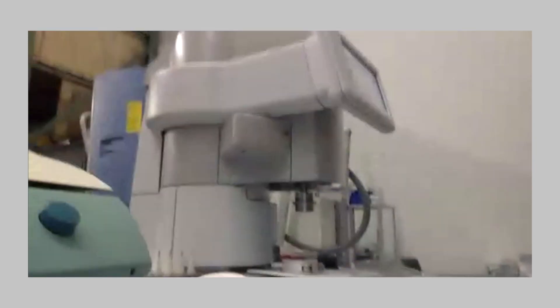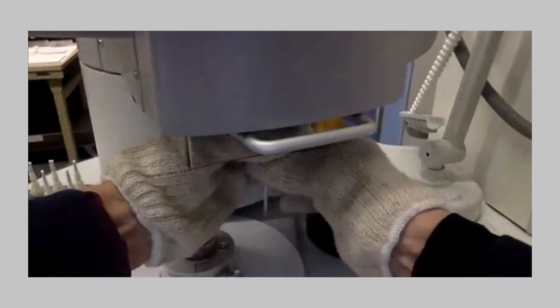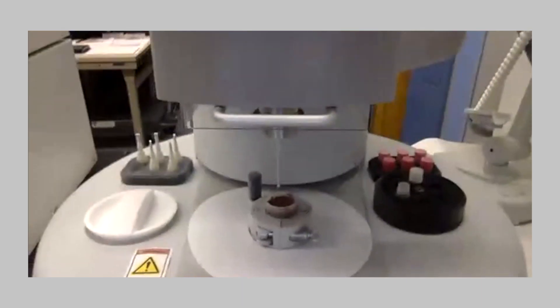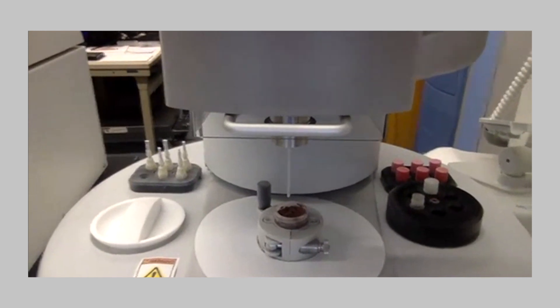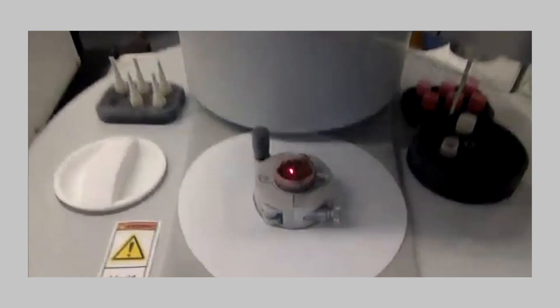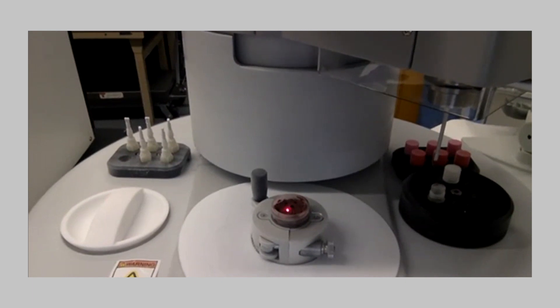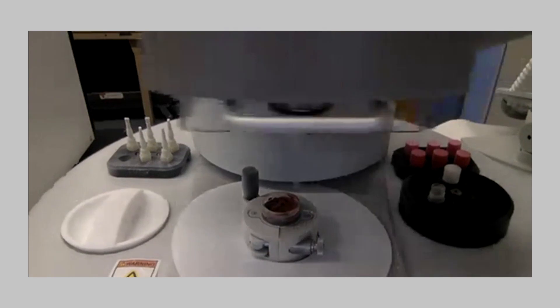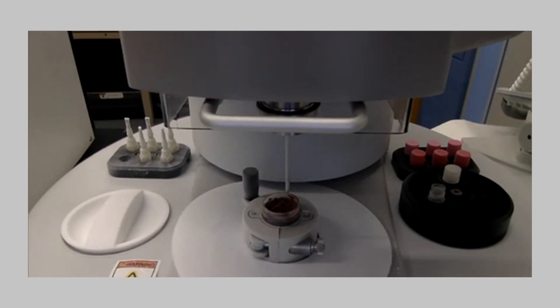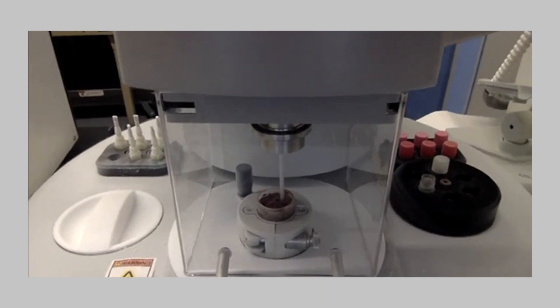You load your coring probe into the spindle. You can then put it in front of the sample. We have a laser — the laser is used to spot where in the sample you want to core. I'm going to move it around, lock my sample holder, lock my handles. I'm going to put the coring head back into position, put the safety guard down, hit OK and my coring probe will go down into my sample.